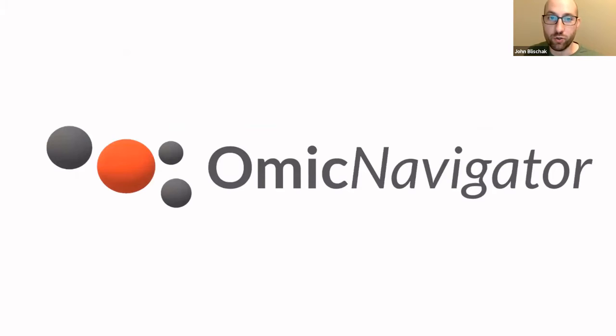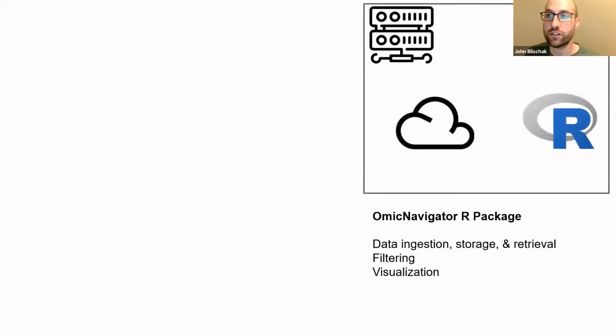Okay, so that brings me to the tool we built called Omic Navigator. To try and give you a high-level view of how this all works, there's the R package that I developed. This is going to do all the data ingestion, storage, and retrieval. It also performs the filtering and custom visualizations. But the idea is this is going to be running on the backend server.